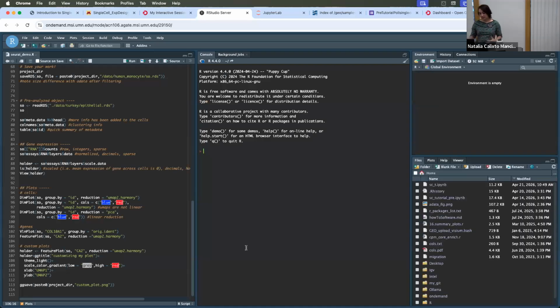I wanted to make a note that I have pre-installed the software that we need, all the packages that we need for this demonstration. But when you do the analysis, you will have to do these installations yourself. There are many packages that are particular to your needs. And for doing that, you have to have a folder where you're going to install everything that you have right permissions. So we'll go through that in a second.